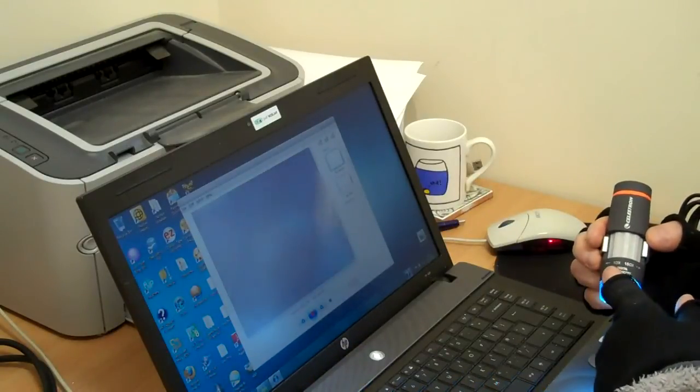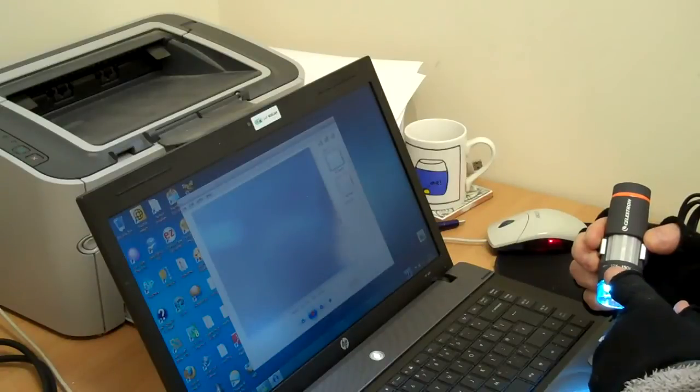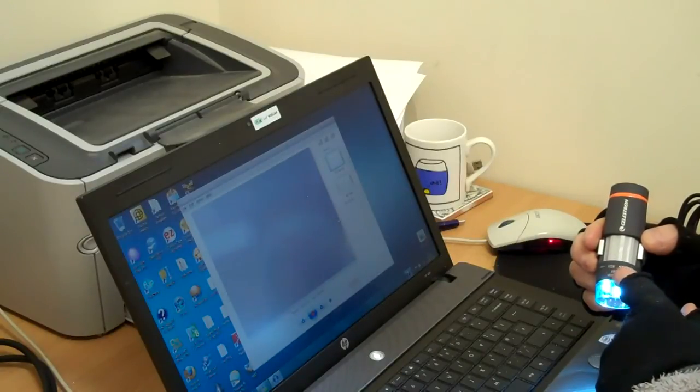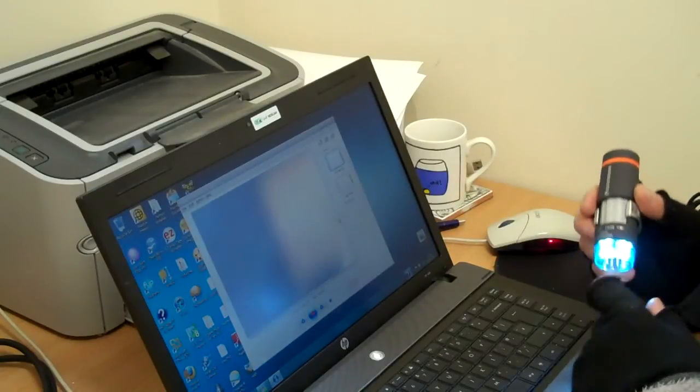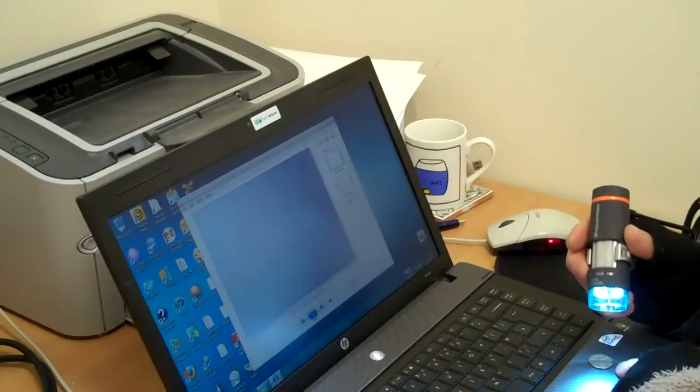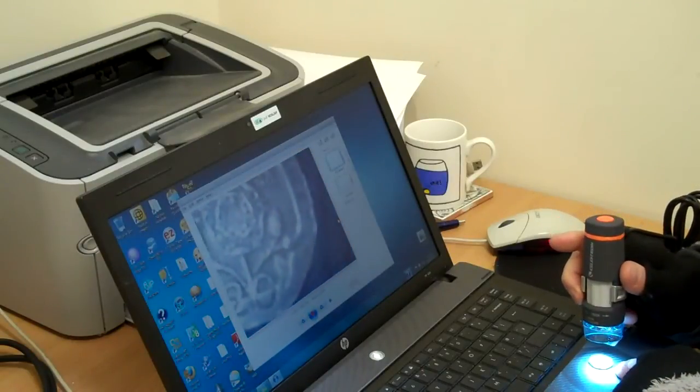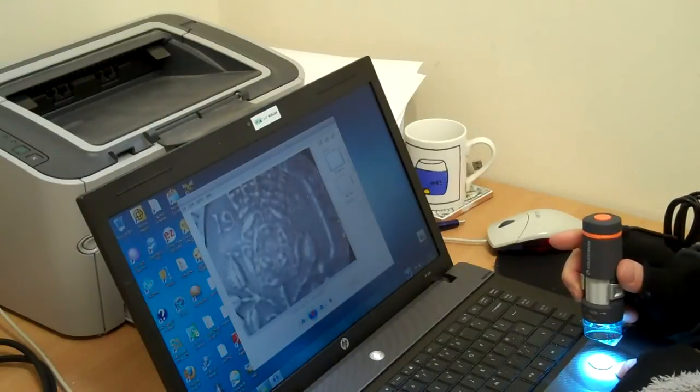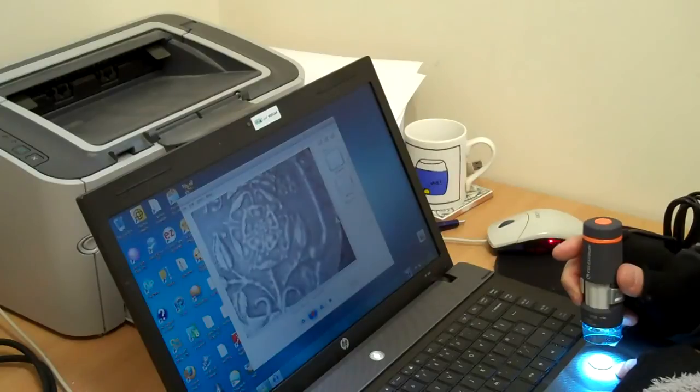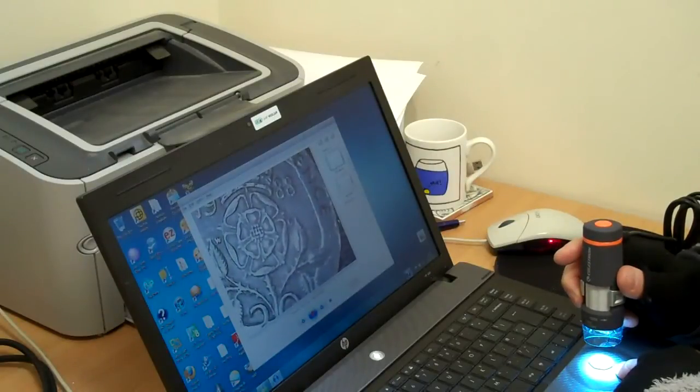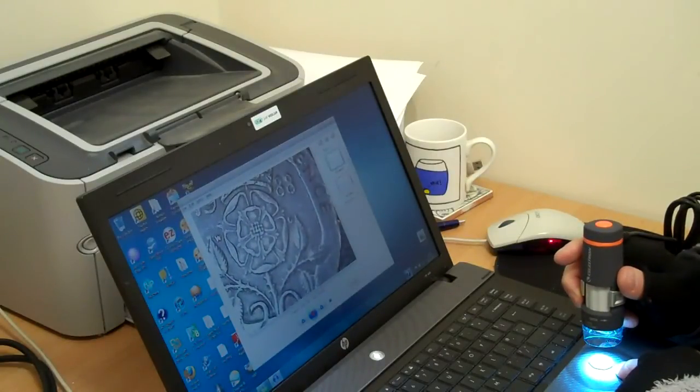So the microscope's magnification is between 10 times and 150 times. And I've got a little UK coin here, a 20p piece. You can see there. I've got a really clear image just holding it with my hand.